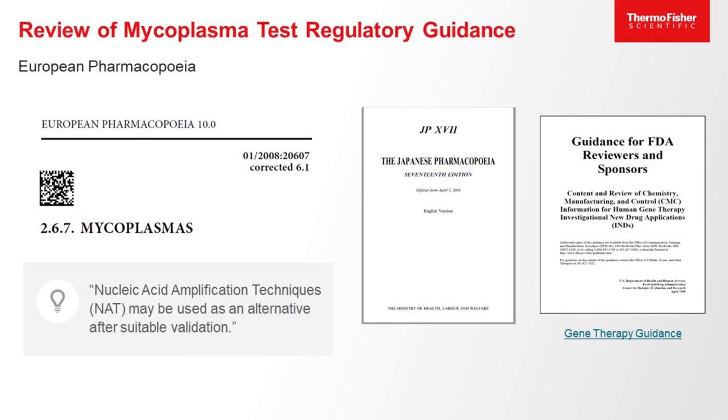In order to maximize the sensitivity of safety testing, regulatory guidance recommends that mycoplasma testing is performed when contamination is most likely to be detected, and mentions PCR-based tests as examples of alternative methods for mycoplasma testing after a suitable validation.